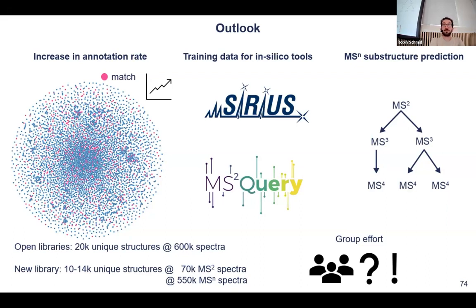Yeah, definitely. So if we put this in the public domain, people are going to get low confidence scores, that's already something. I guess that's what you said. But still, it would be good to have some tags and some scores to give more evidence to it.